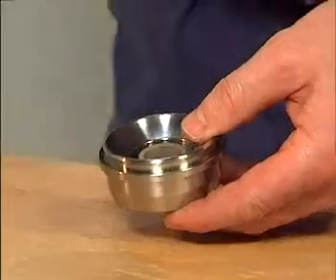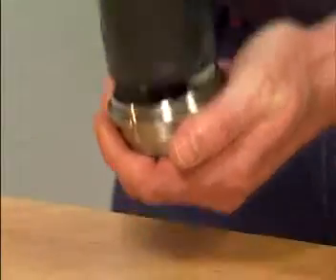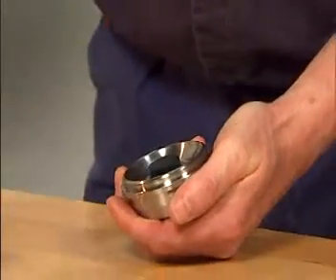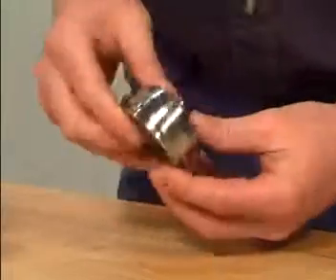If needed, use the composite bushing tool together with the rubber mallet and gently tap it into position. Mounted correctly, the composite bushing should stick out approximately 1 mm on the other side.